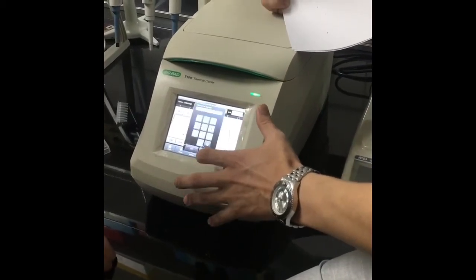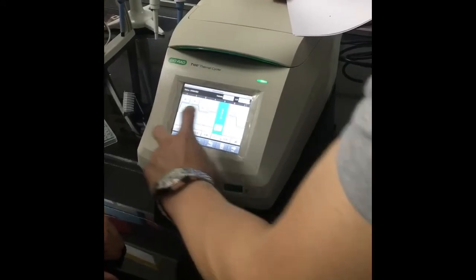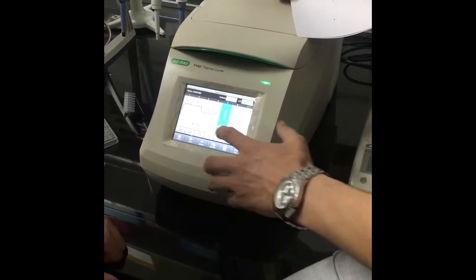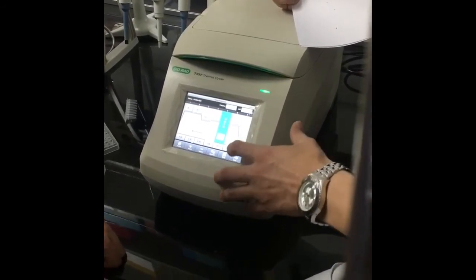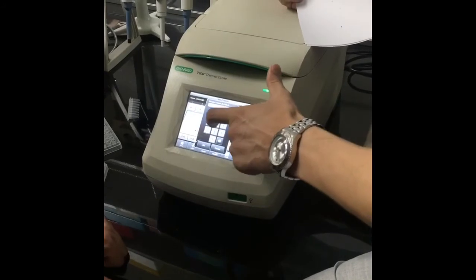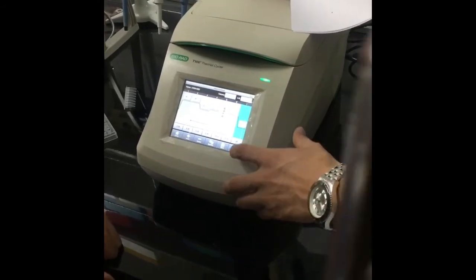No, we need 20 cycles, right? This means cycle, okay? The cycle goes from step 2 through 3 and 4, repeating 2, 3, 4, right? Then final extension at 72 for 5 minutes, and infinity at 4 degrees. And our volume is how much? 20 microliters volume. Then it's done.